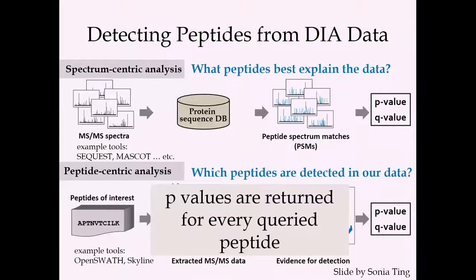In this case, you get basically a direct p-value, which is something that we're interested in, right? One of the hallmarks of analytical chemistry, which anyone who's taken a basic quantitative analysis course knows, is that one of the things you learn early on is how to define your limit of quant and your limit of detection. And in many ways, I think this peptide-centric analysis and the p-value is basically whether or not you have evidence for that peptide. It's whether or not your peptide is above your limit of detection. That's the closest analogy that brings it home to classical analytical quantitative analyses.